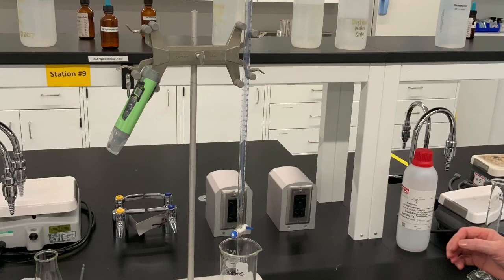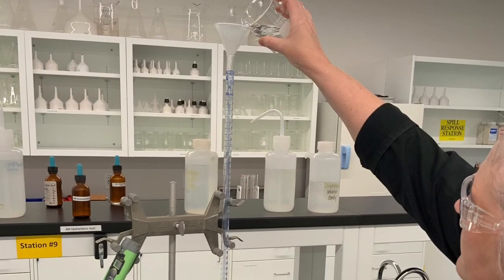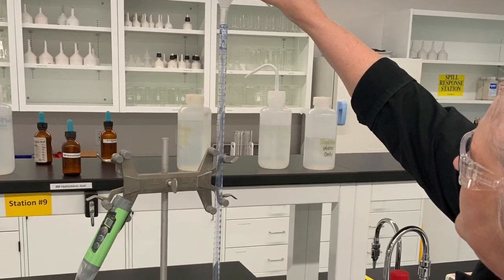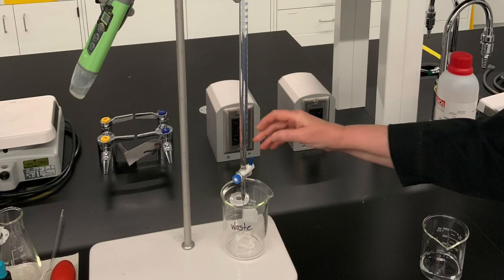First step is to condition the burette with the sodium hydroxide solution. The fastest way to do that is to fill the burette all the way up with the sodium hydroxide solution and then release the whole volume, one burette full, into a waste beaker.